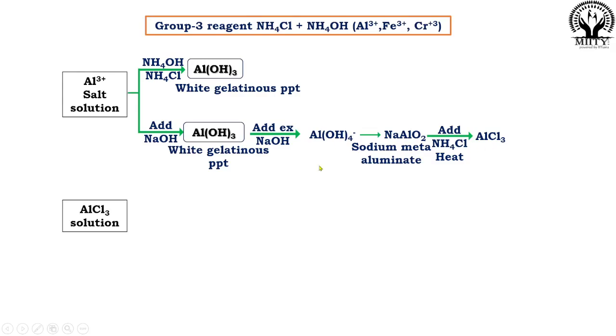To this AlCl3 solution, we add blue litmus solution. AlCl3 is acidic in nature, being a salt of a strong acid and a weak base.